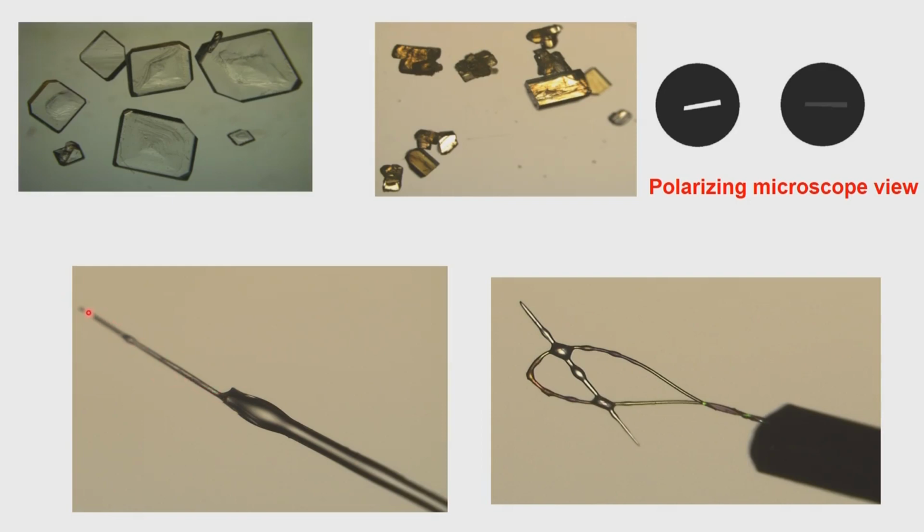So, whatever comes out in the form of diffraction is that from the crystal. So, we get different sizes of these Lindemann capillaries which can be mounted up here, and so these are the two ways in which you collect the data.